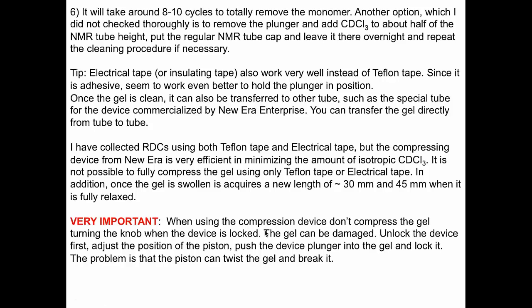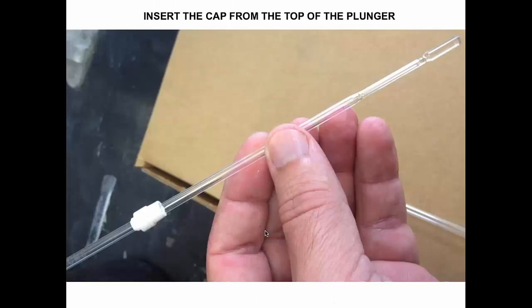If you use the compression device, you will have to move what we call the screw, I don't know how to say it, the nut and the bolt. You push the gel, move it up, and then push the gel with the piston. Let me show you the device here.